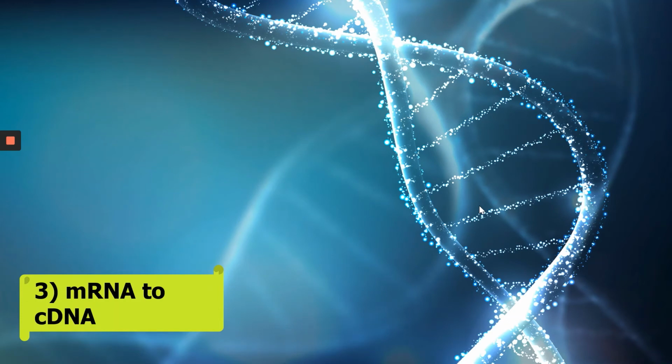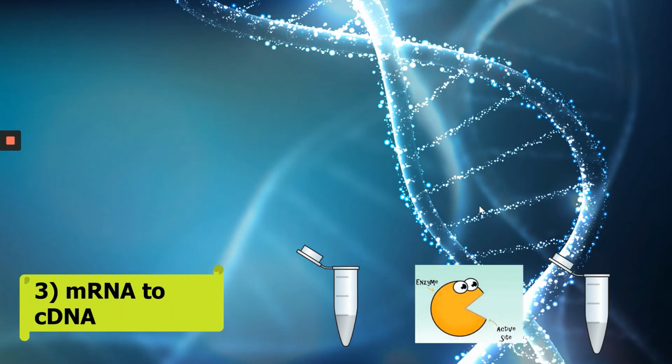Why do I need to do that? Because naturally mRNAs are less stable than cDNAs. So cDNAs will increase the success of the experiment. So how do we do that actually? We use an enzyme called reverse transcriptase.